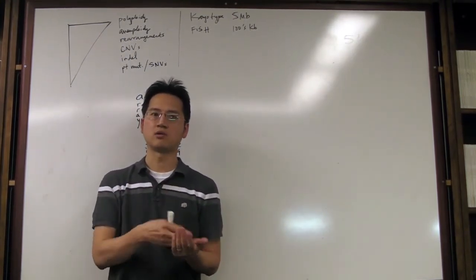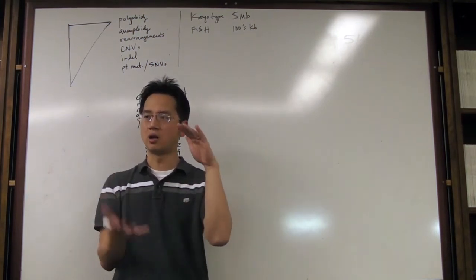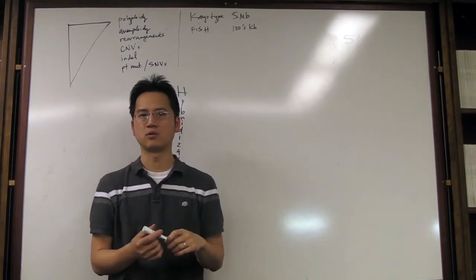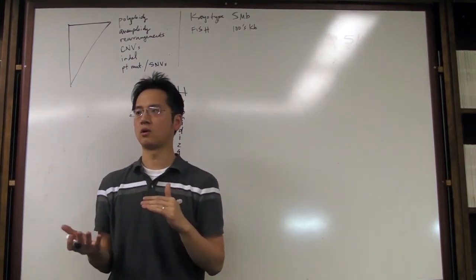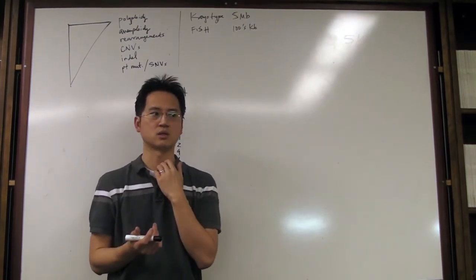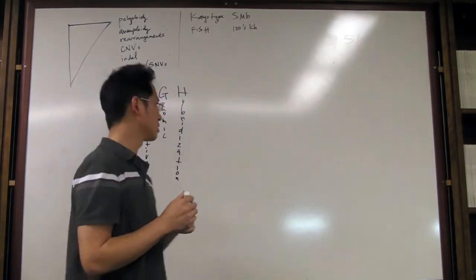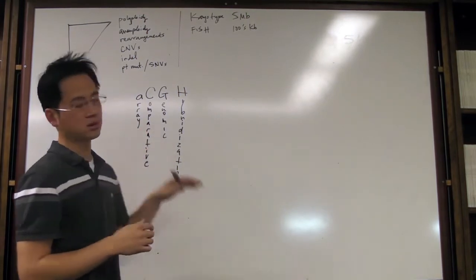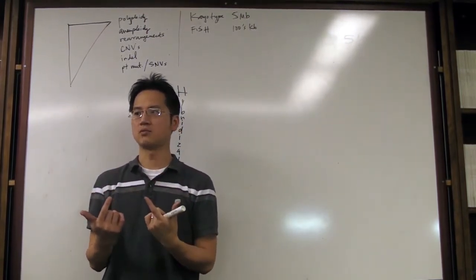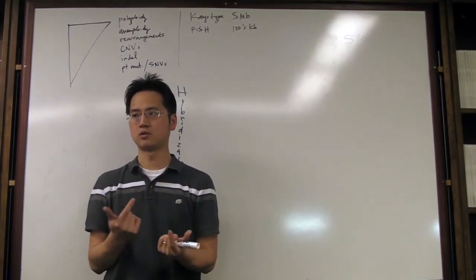If you take RNA, convert it to cDNA, and have an oligo chip that recognizes different genes and different exons that you're trying to look for, you could assess gene expression in terms of copy number of alleles that are being expressed. So what we're going to talk about today are DNA microarrays used for detecting dosage of DNA. How many copies of DNA do you have in a patient relative to a control?